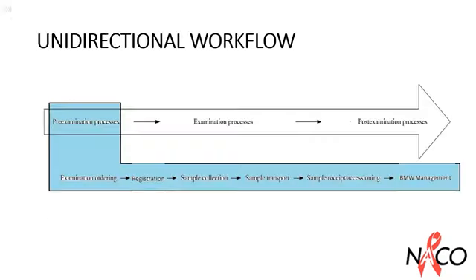The unidirectional workflow of the pre-examination processes includes examination ordering, followed by registration, sample collection, followed by sample transport, the receipt of the sample and accessioning, finally biomedical waste management.